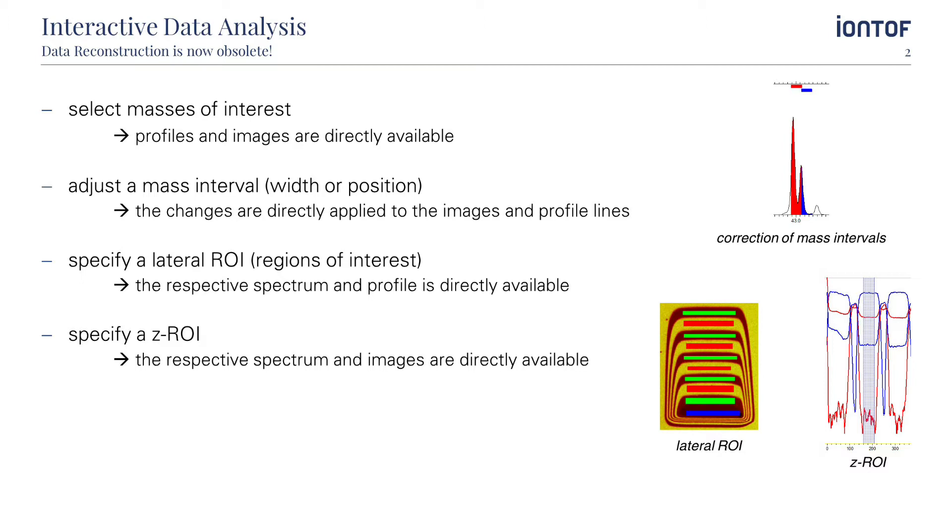Interactive Data Analysis implies that if any mass interval is added to the peak list or if its position is adjusted, all changes are instantly applied to the profile and image output as well.